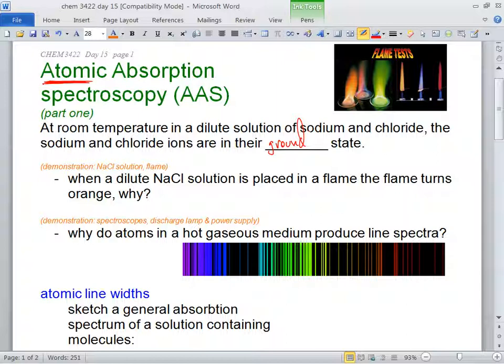You seen this? This is one Gen Chem lab that I miss, man. I had a lot of fun doing this. You get all these metals, right? And then you put them in water. Then you have to get the little wire that I was bothering Andy with, right? Oh, I need my flame. Right? We don't do this lab here, I don't think.